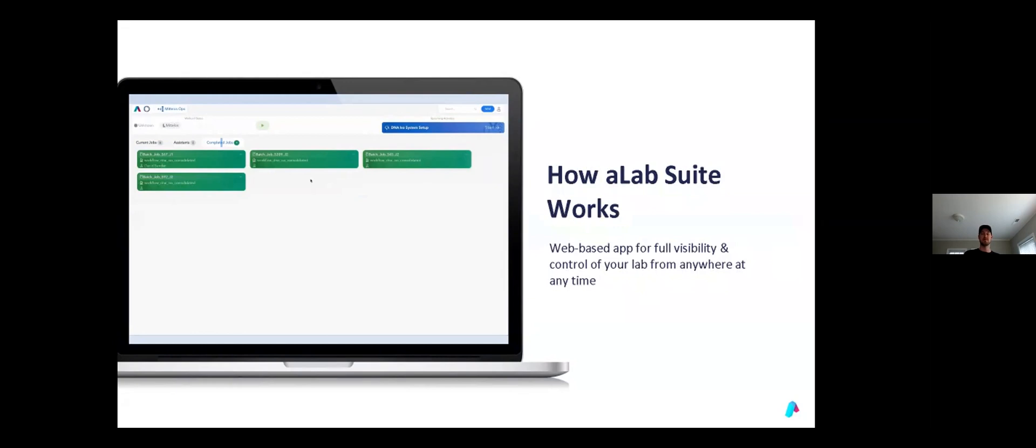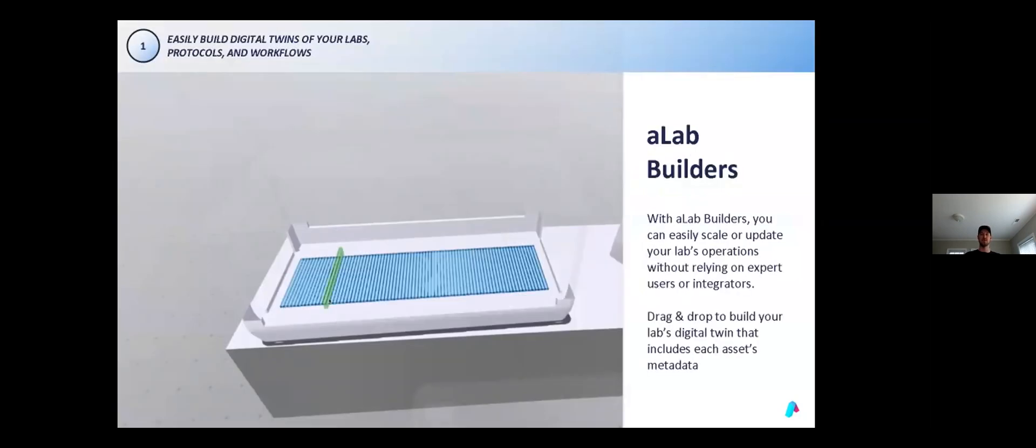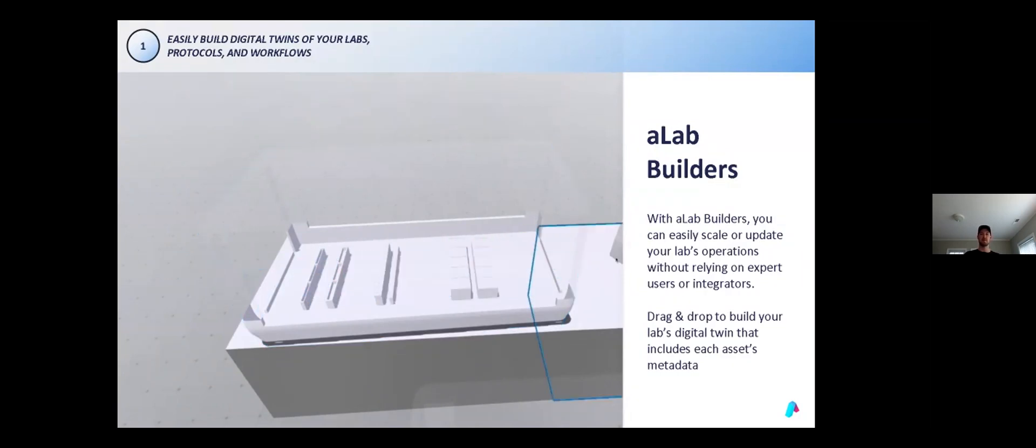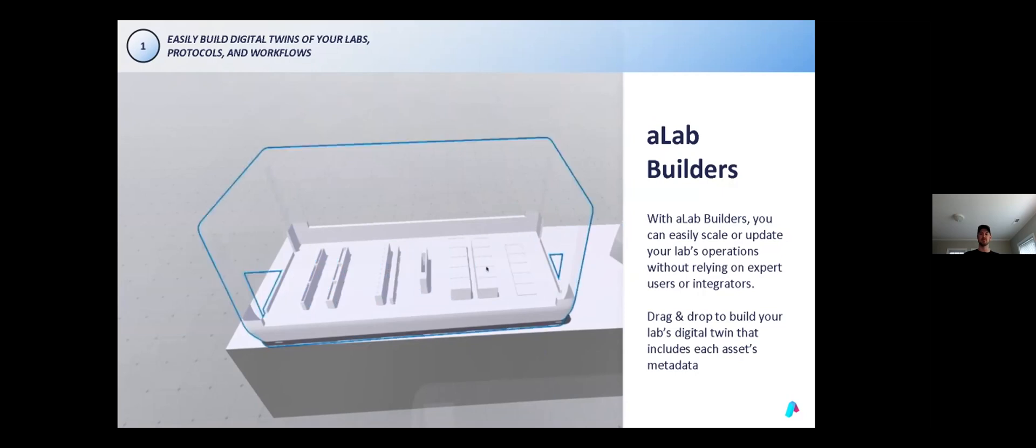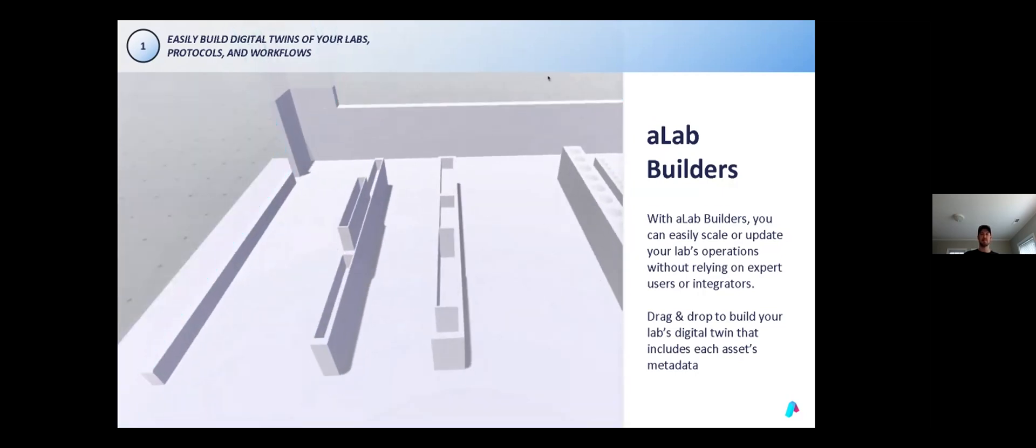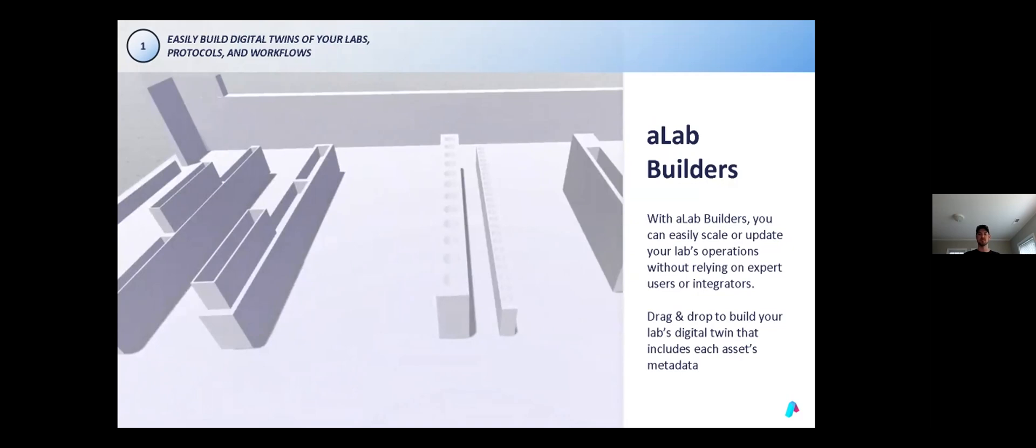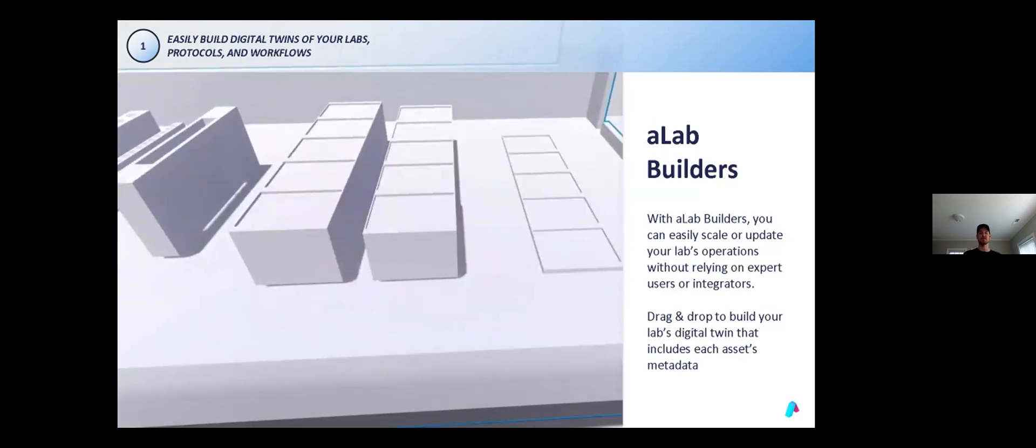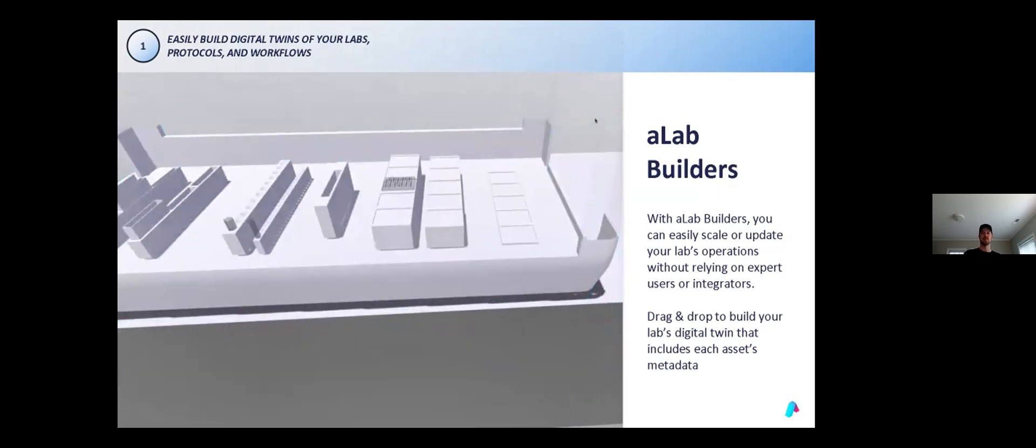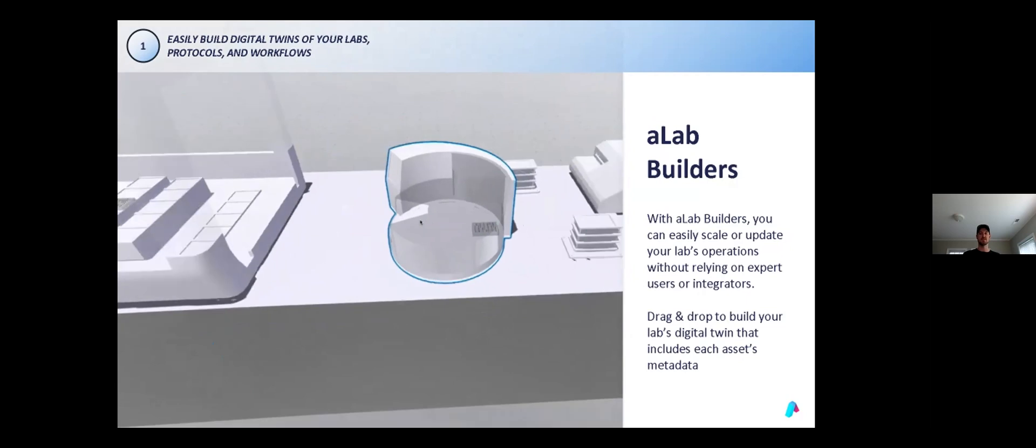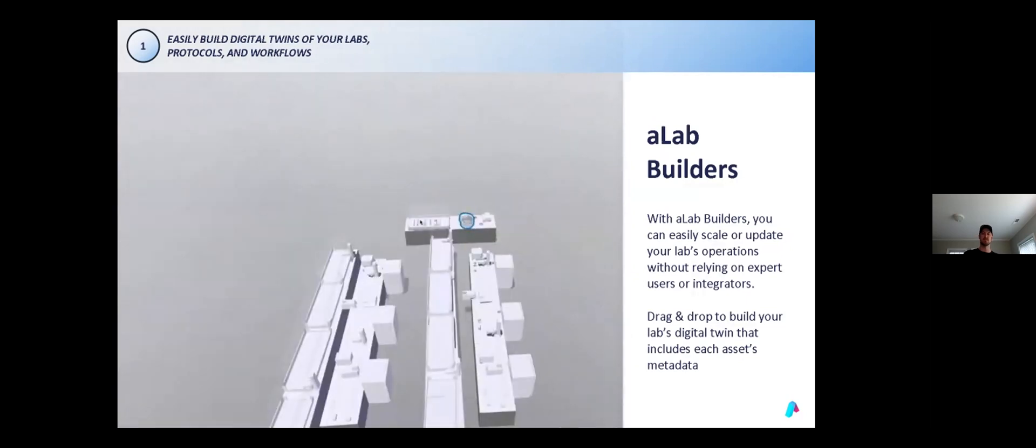One of the views in our app is our lab builder. The lab builder allows the users themselves to construct a digital twin of their lab. In the lab builder, we have a library of equipment that we have layered with what we call common sense lab physics: where plates are allowed to go, which hotels attached to which mounts, how a robot moves, or even the way a plate needs to be oriented. To use the lab builder, you drag and drop equipment from our library with features to assist in intelligently snapping parts together, thus building out a complete digital twin of your lab environment.